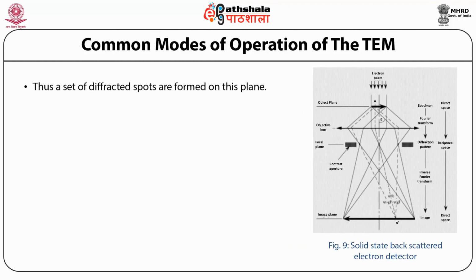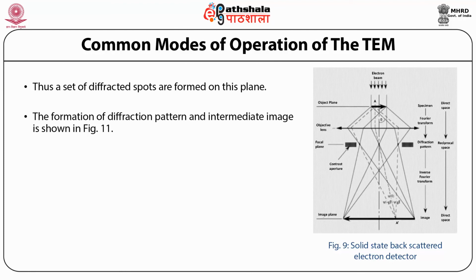Thus, a set of diffracted spots are formed on this plane. The formation of the diffraction pattern and intermediate image is shown in figure 11.